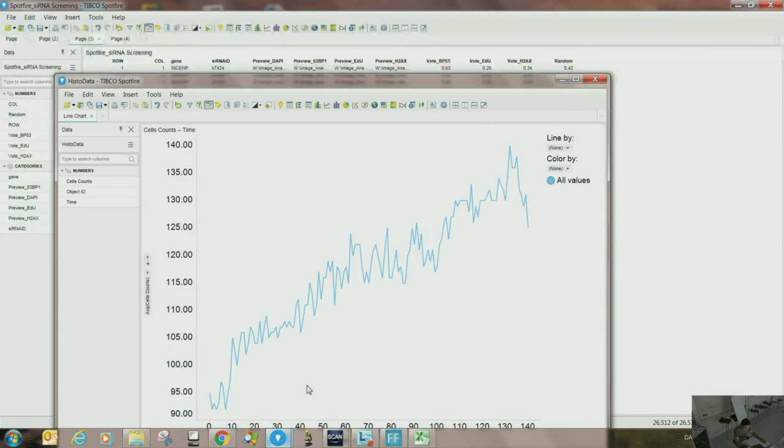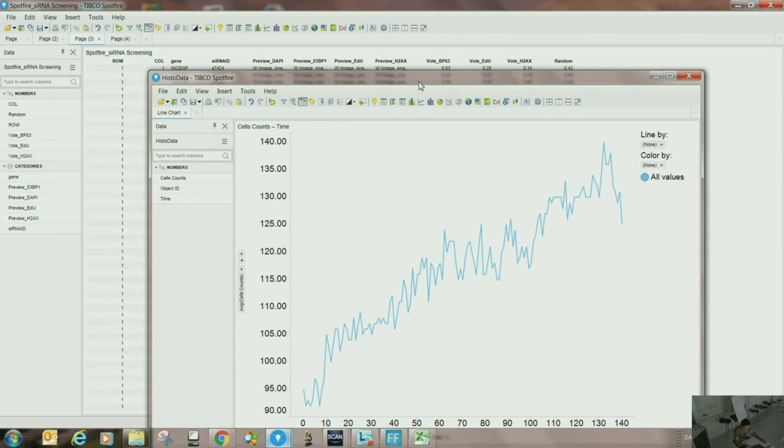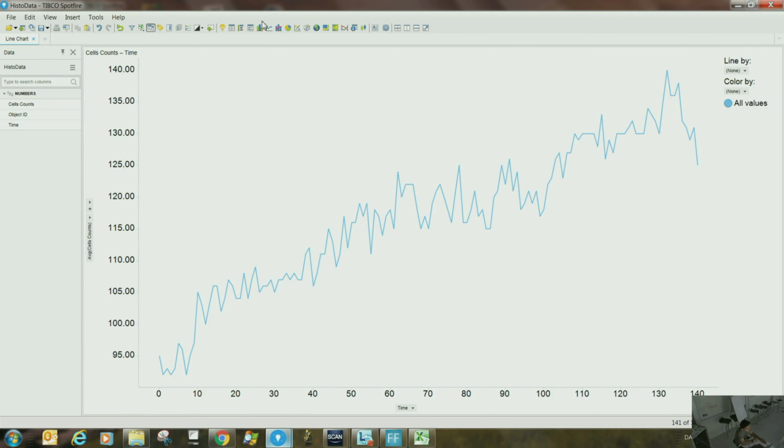So that's all about Spotfire over this one. There is one more thing that you can do. Especially for DanStem and also for CPR, people do live cell imaging, but for 2D, and you guys do 3D. So if you do live cell tracking using Imaris and then export your data, one of the columns is the time, and the feature would be according to your interest. It may be cyclin degradation, maybe for you it's just the GFP expression. But no matter what, you have one column which is time, and another column is some feature that you are interested in.